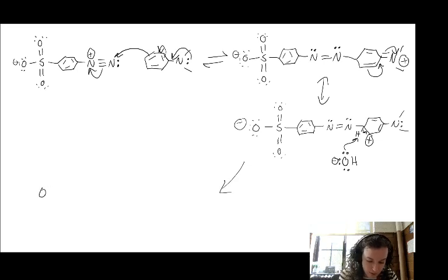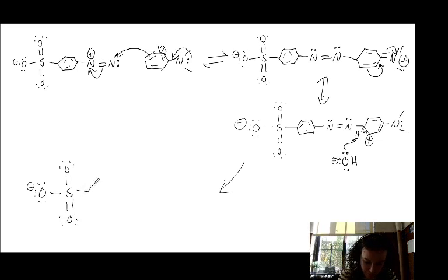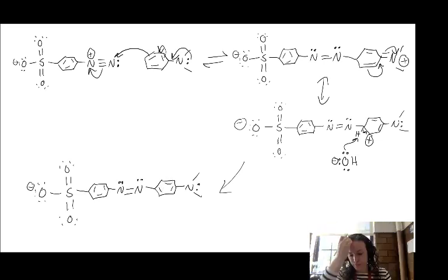And so, folks, at the very end, we have our beautiful methyl orange product, just like that.